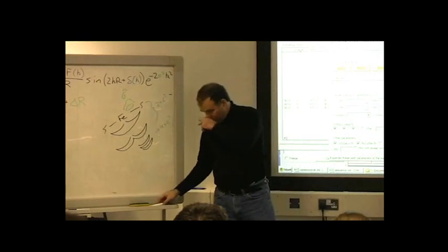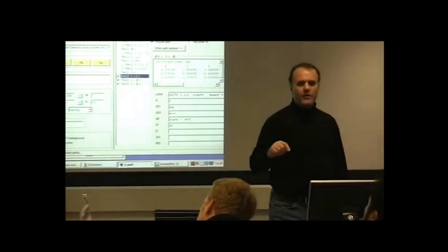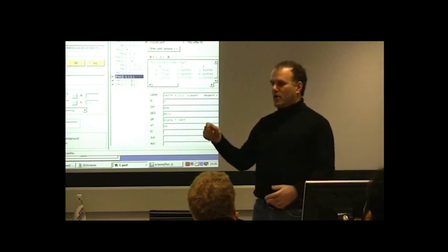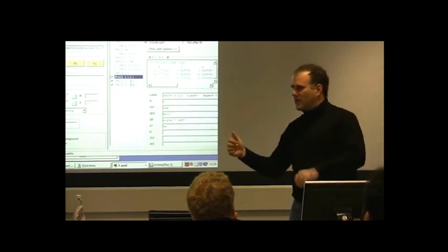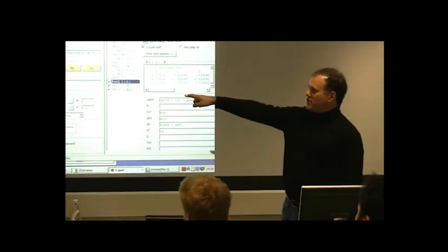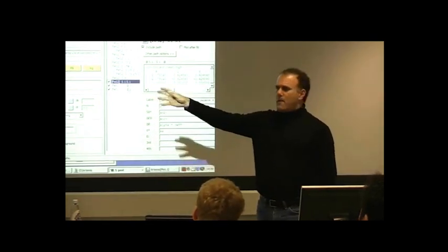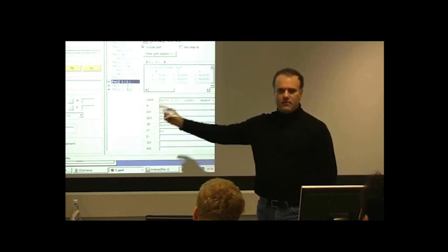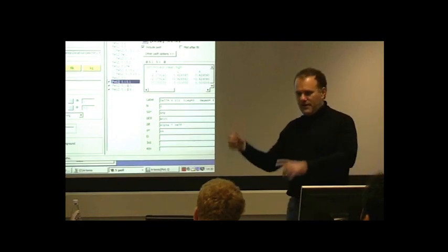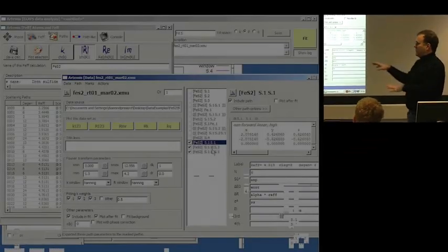There's a handout that goes along with this talk. It's one of the things that I pointed you to download before, and it's one of the things that's on my GitHub site. And I give the reference to the derivation of 2 times sigma squared and 4 times sigma squared. It's really quite simple, and you can probably figure it out just by thinking about it or doing a little bit of math on the back of an envelope. Or you can go check out the reference in the PDF file that is the follow-up to this presentation. So those numbers are knowable.